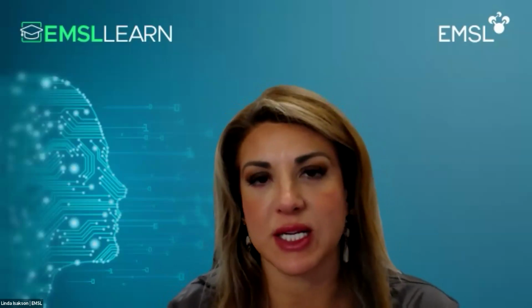Okay. So the next question is from Trang, and this one again is for you, Shuttha. Could you please give us a sense about the time and cost estimation for each soil sample using XPS?